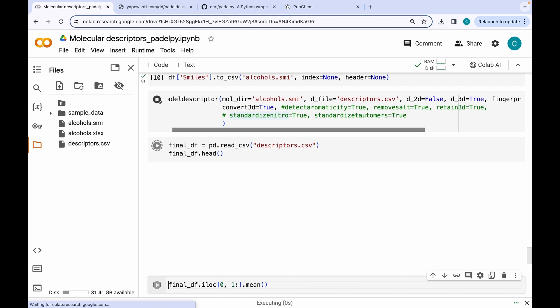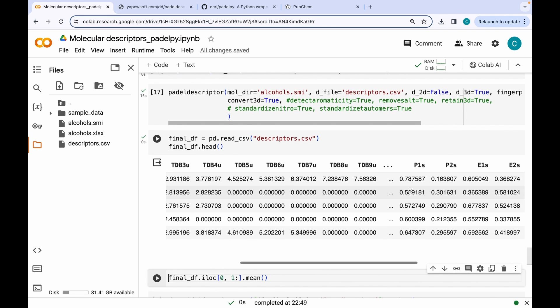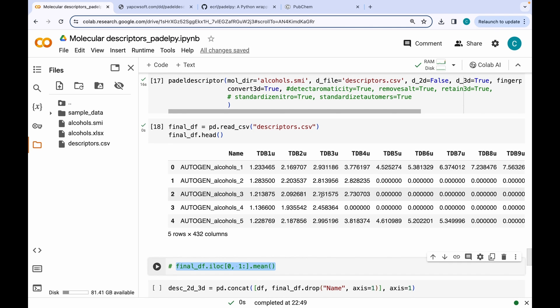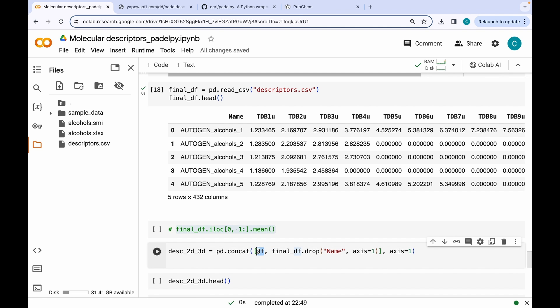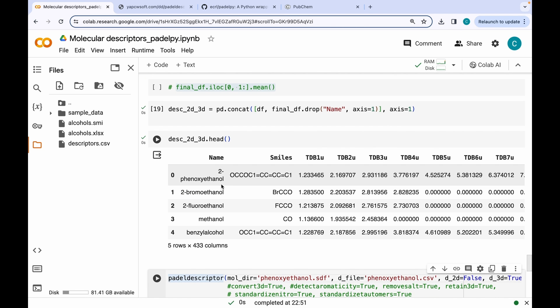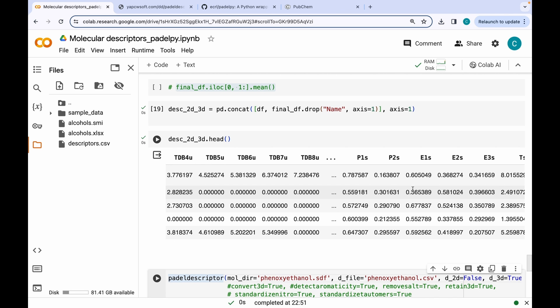Let's run this again and see the output. Now all the descriptors have numeric values, meaning PaDEL descriptor was successful in generating all the 3D descriptors. To associate the descriptors with their corresponding SMILES strings, I drop the name column and concatenate it to our original dataset containing names and SMILES strings. Now we have the dataset with names, SMILES, and all 3D descriptors, which you can download as an Excel or CSV file.